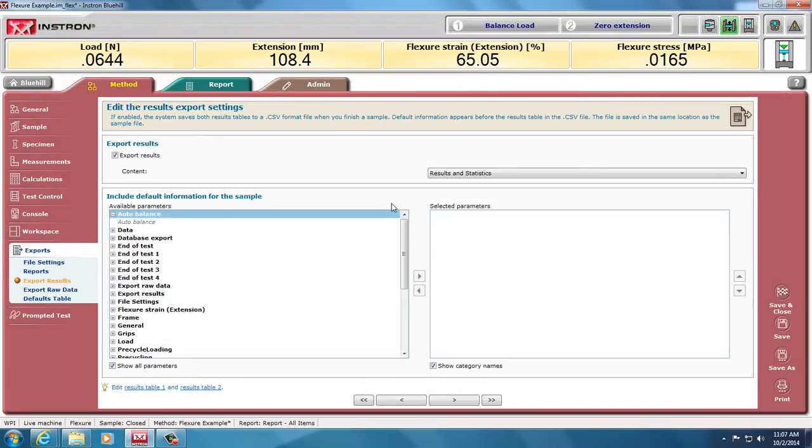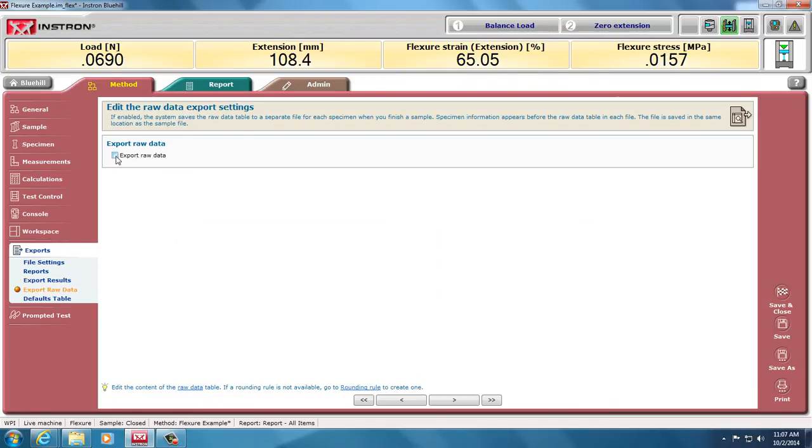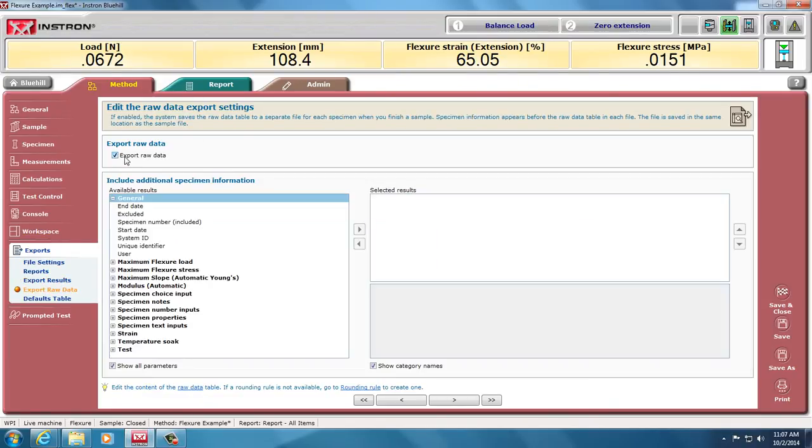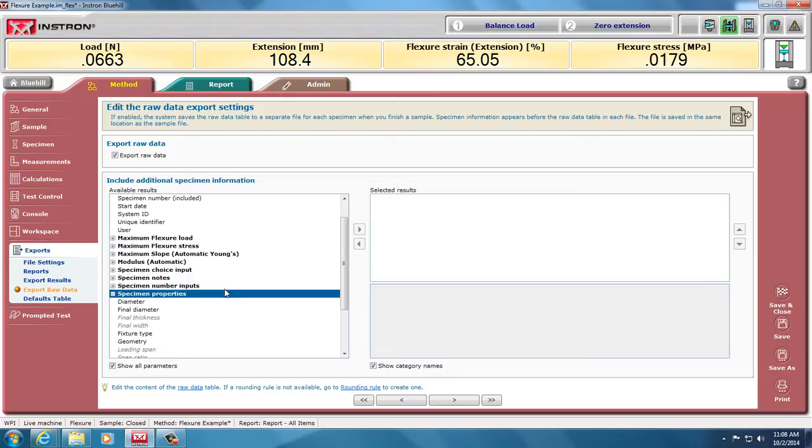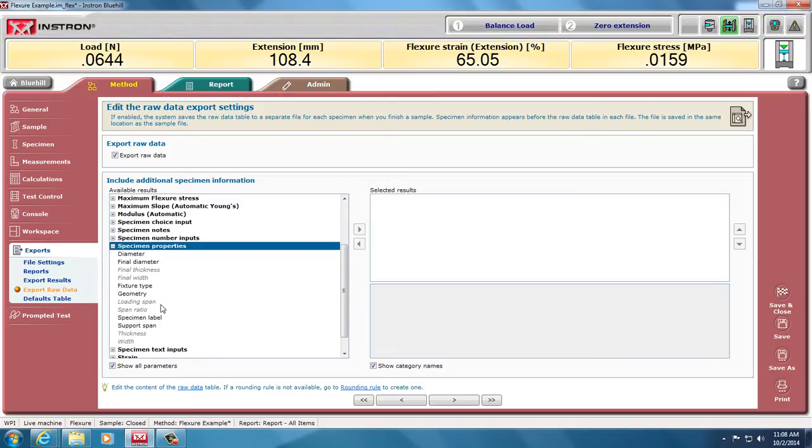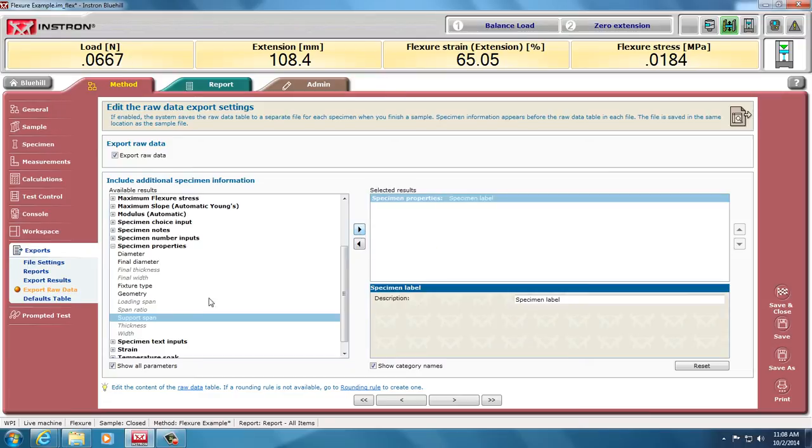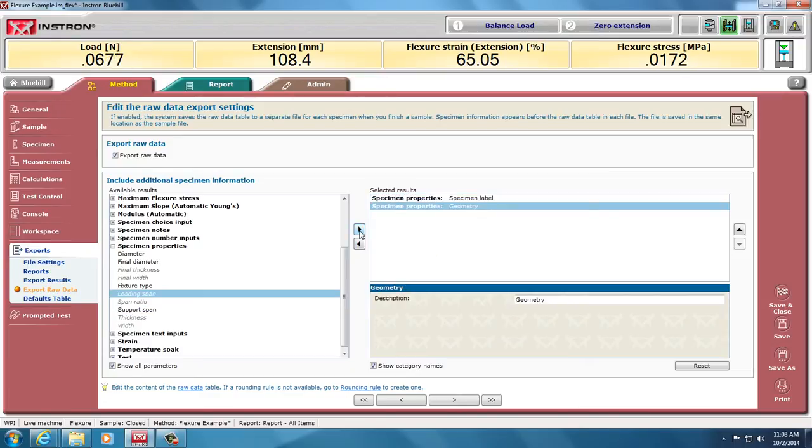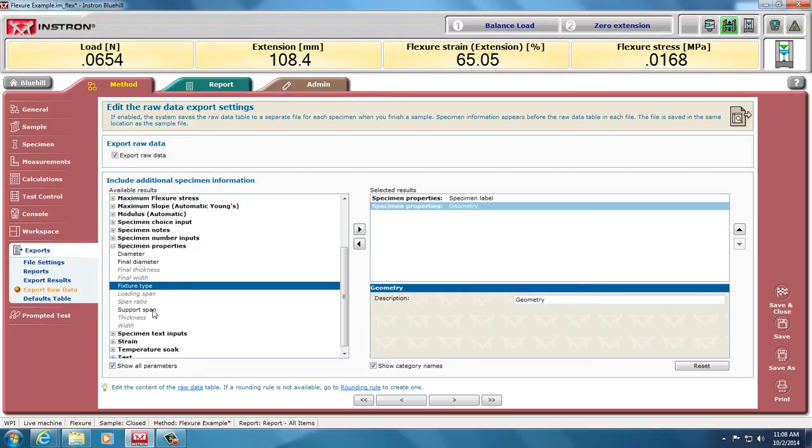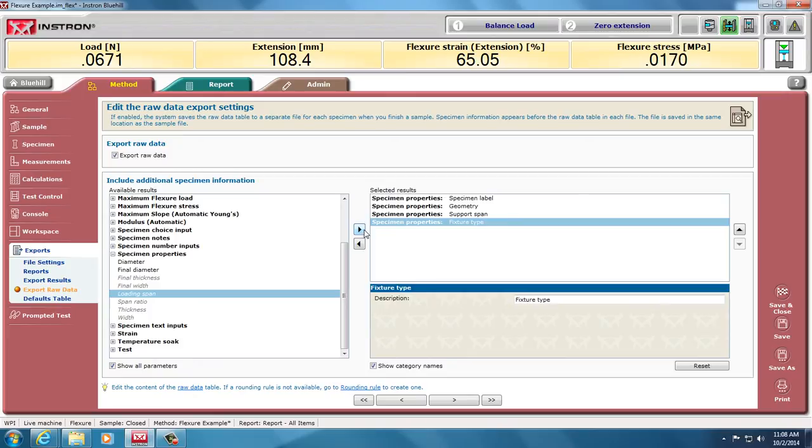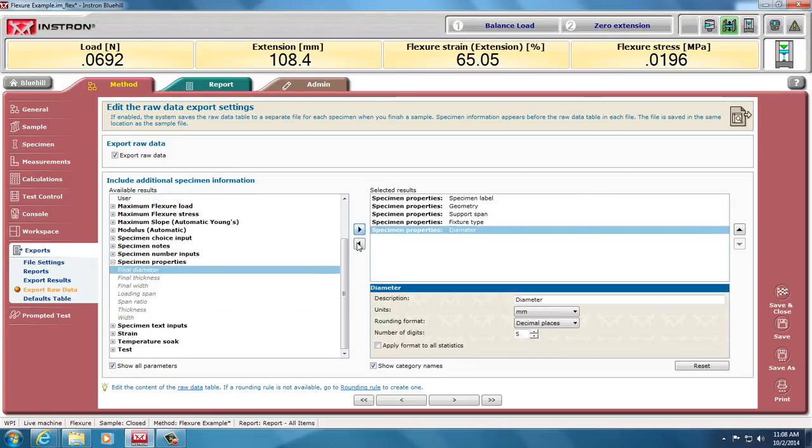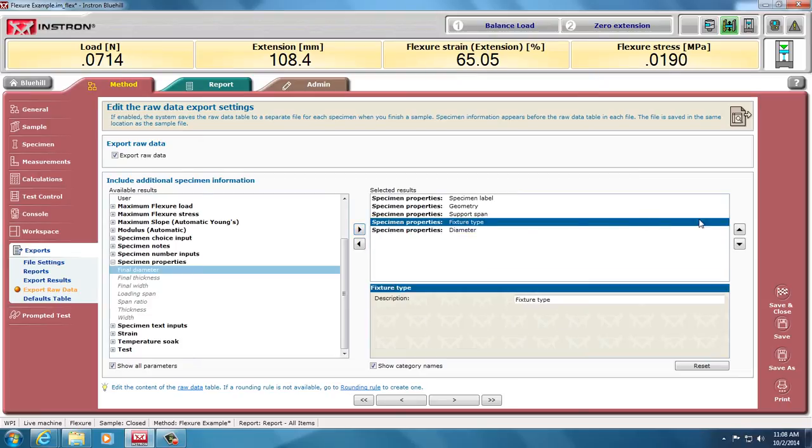Exporting the results is that results table we did under the workspace, so the calculated values, and for post-processing, I need my raw data. I can also add, at the beginning, my specimen properties, so I know what the tests were within that file. In the header of that file, I can say, well, what did I call my sample? Was it circular or rectangular? What was the support span for my three-point bending? Was it three-point bending? And then what was the diameter of that specimen? I can move that up.